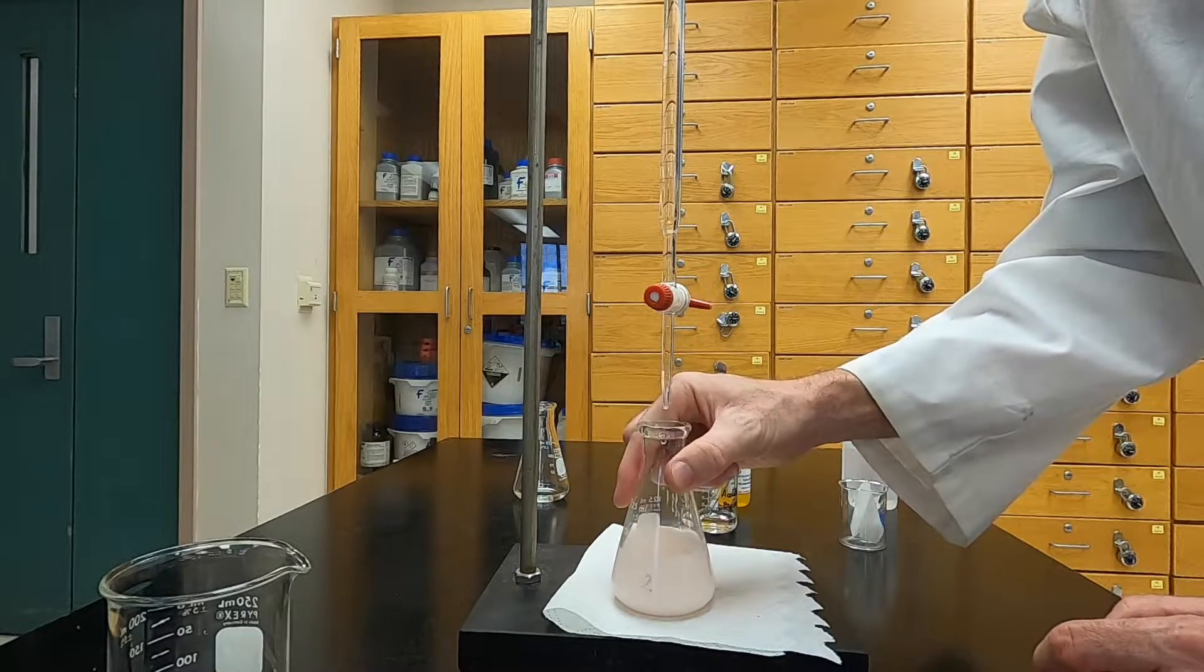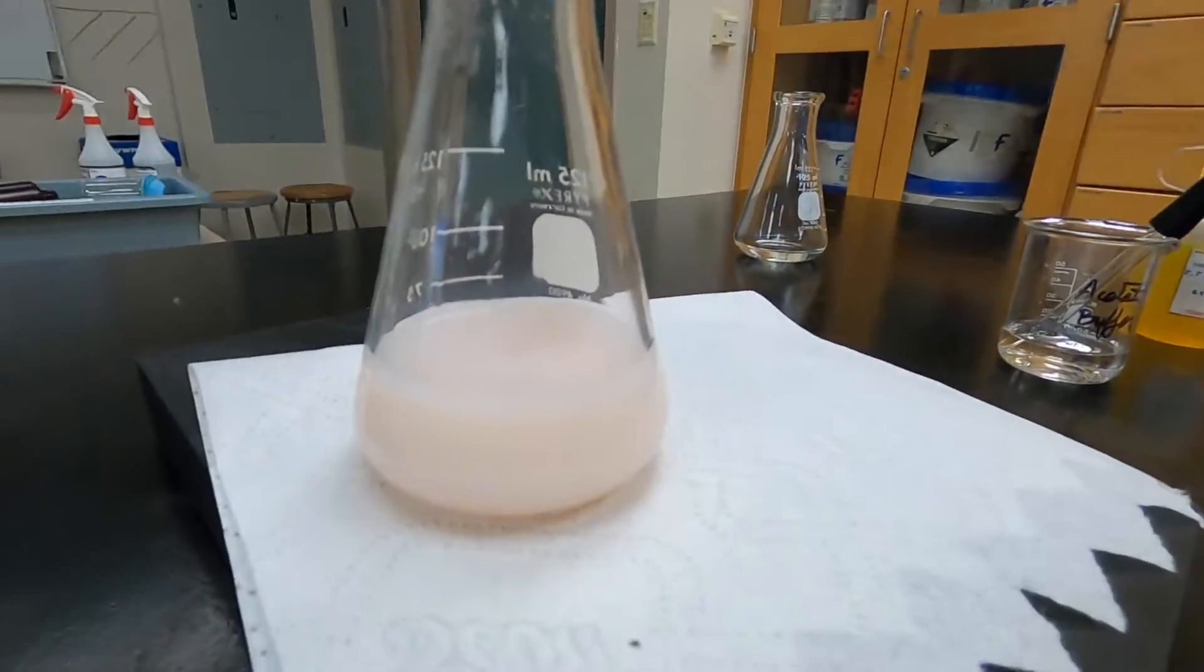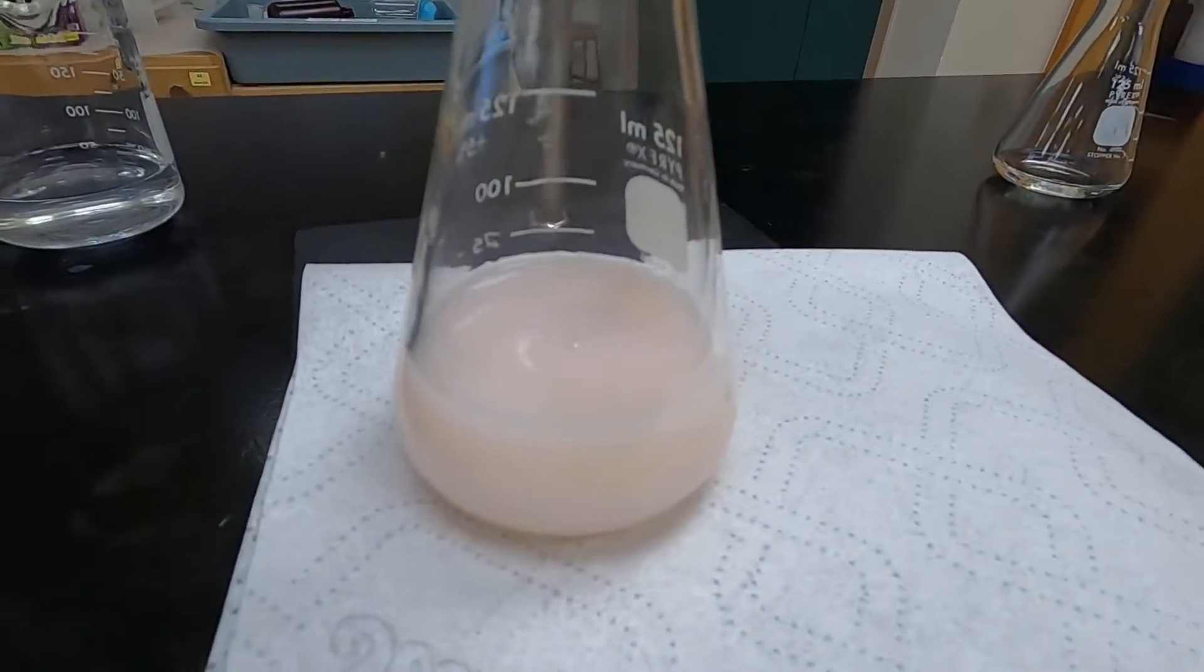You may find that keeping your titration flask on a white piece of paper towel or white piece of paper makes it a little easier to distinguish the exact color of your endpoint.